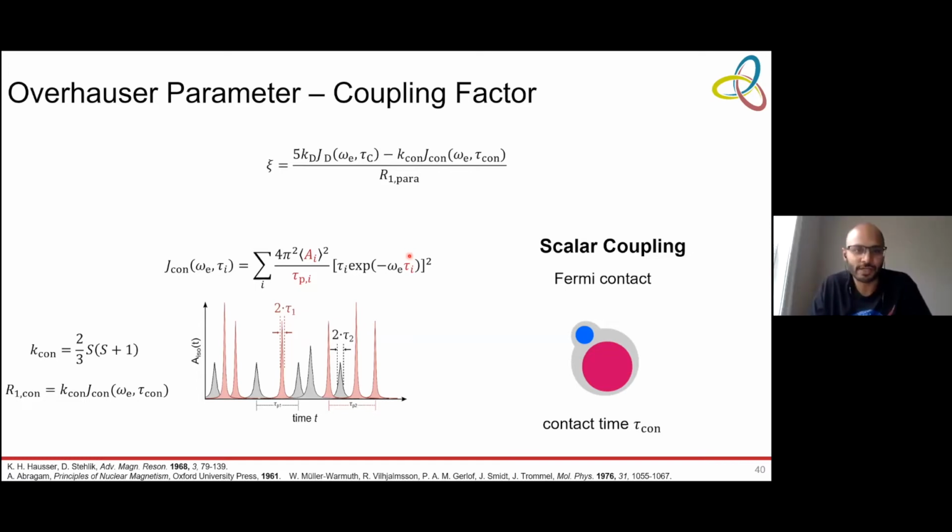So just to visualize this factor a bit more, suppose I have a BDPA molecule compared to a TEMPO molecule. BDPA is large. So when you talk about these molecules colliding, can it contact anywhere on the BDPA surface? Or say if you have a radical which is bigger, with a larger surface area compared to TEMPO, will it be better in terms of this constant factor to have a larger molecule? I actually talk about that very point in the second part. If it's okay for you, I would postpone the answer, because I will definitely touch this topic and explain it. Sure.